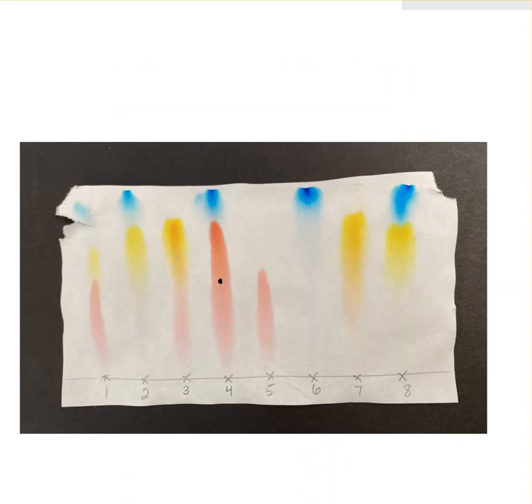And this is what it looks like when we're done. And this is not a great one. And the reason that I say that is that these spots are really big. And in fact, some of them, like this red, are just a big smear. So when you get the spots, you have to judge where the center is, and it's harder to do when they're so large. Your chromatography paper will look better than this, but we're going to judge how high up those go.